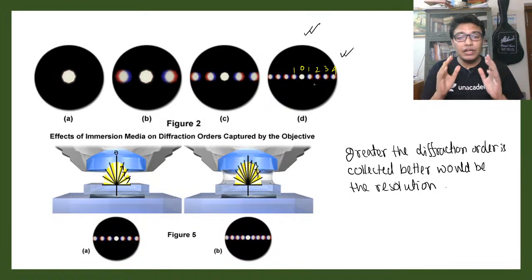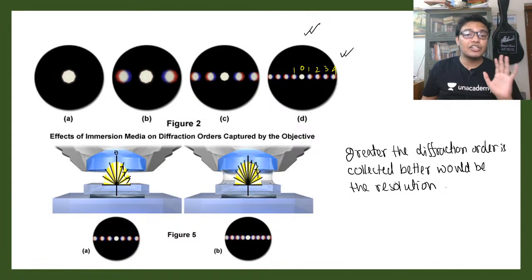So what we have learned so far is that every microscope image is nothing but a diffraction pattern. It's an interference phenomenon of these diffraction patterns. That's the exact quote that Abbe mentioned: an interference phenomenon due to the diffracted light. Now you understand this part, right?